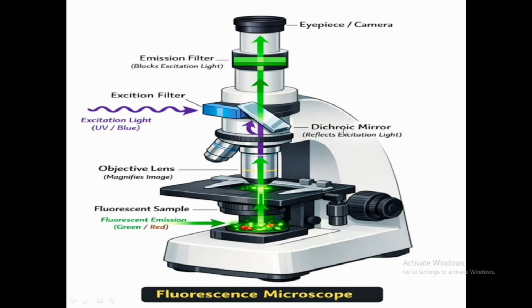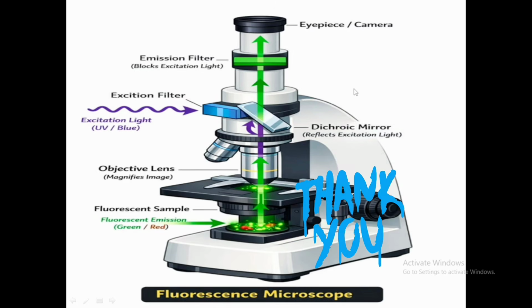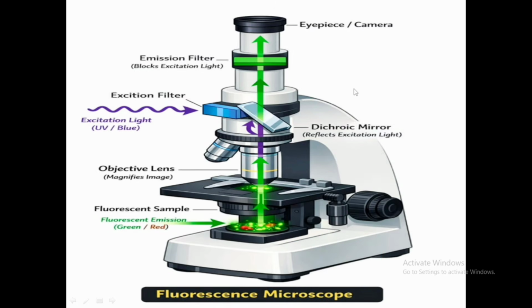And one more is that it is very expensive compared to the light microscope. The fluorescence microscope is very expensive.